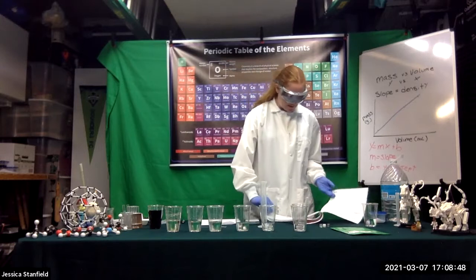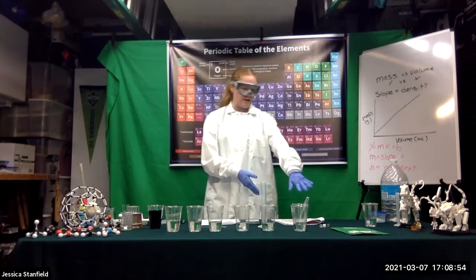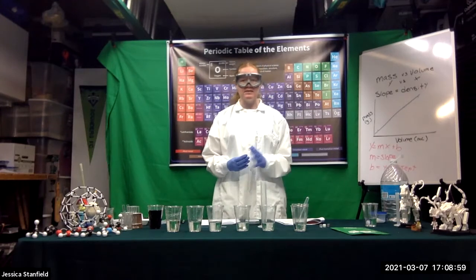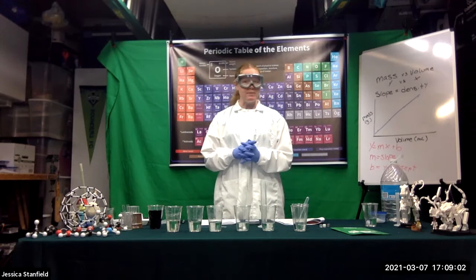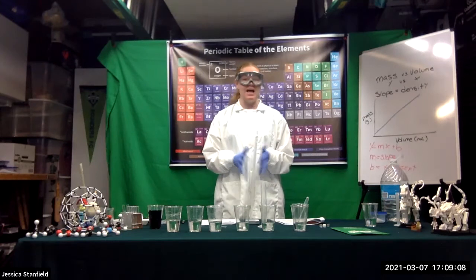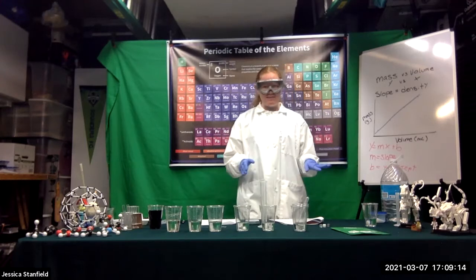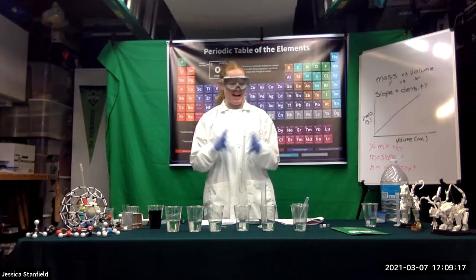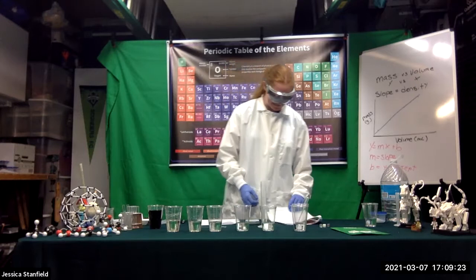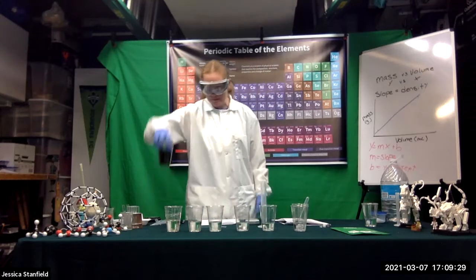Okay, then the next part is you'll want to go ahead and get the densities of your solutions and the densities of your cylinders before you do activity 3. Activity 3 wants you to look at the densities of your 3 cylinders and the densities of your solutions and make predictions about whether or not each cylinder will sink or float in a respective solution, and then test that. Okay? And I don't want to ruin your predictions, so I'm not going to drop any of my cylinders into any of my solutions because I don't want you to be influenced by what you've seen in this video when you're making your predictions. Okay, and then the very last part is going to be your beverage.